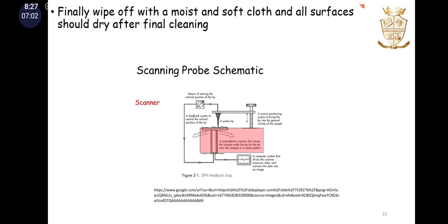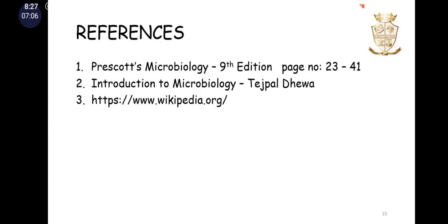This is the scanning probe microscope schematic diagram. That's all.